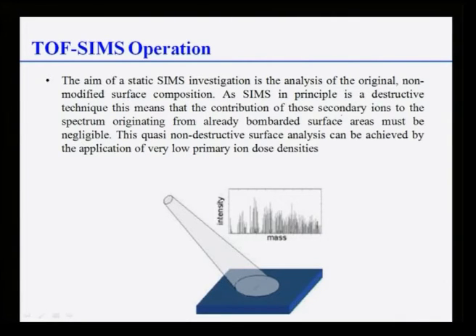But to give you some idea, static SIMS experiments analyze the original, non-modified surface composition, using time-of-flight measurements. It is basically a quasi non-destructive surface analysis because it uses a very low ion dose.